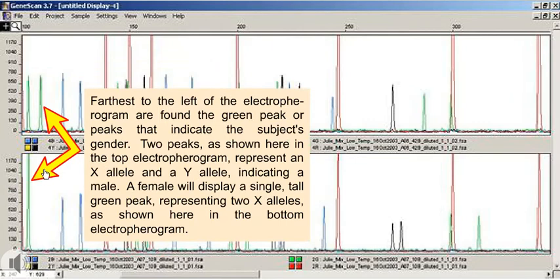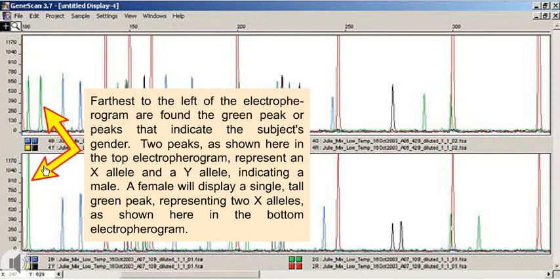Farthest to the left of the electropherogram are found the green peak, or peaks, that indicate the subject's gender. Two peaks, as shown here in the top electropherogram, represent an X allele and a Y allele, indicating a male. A female will display a single tall green peak, representing two X alleles, as shown here in the bottom electropherogram.